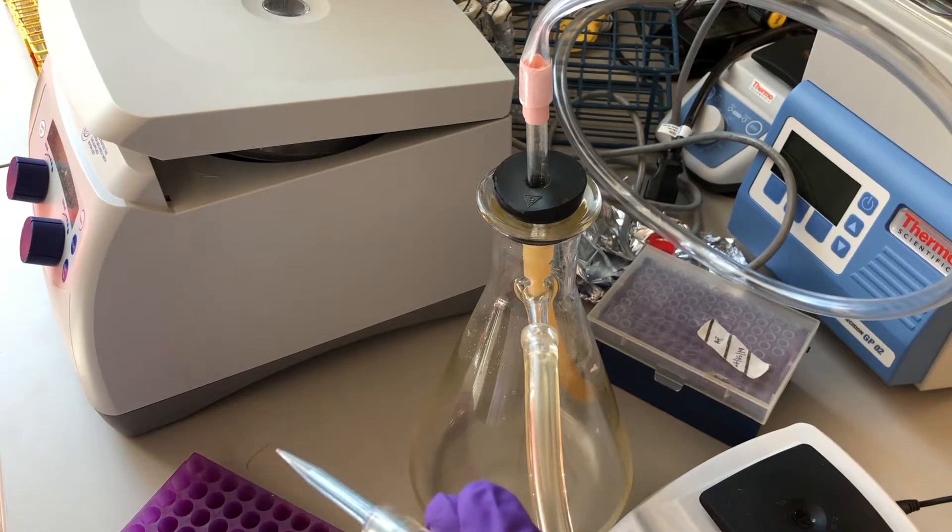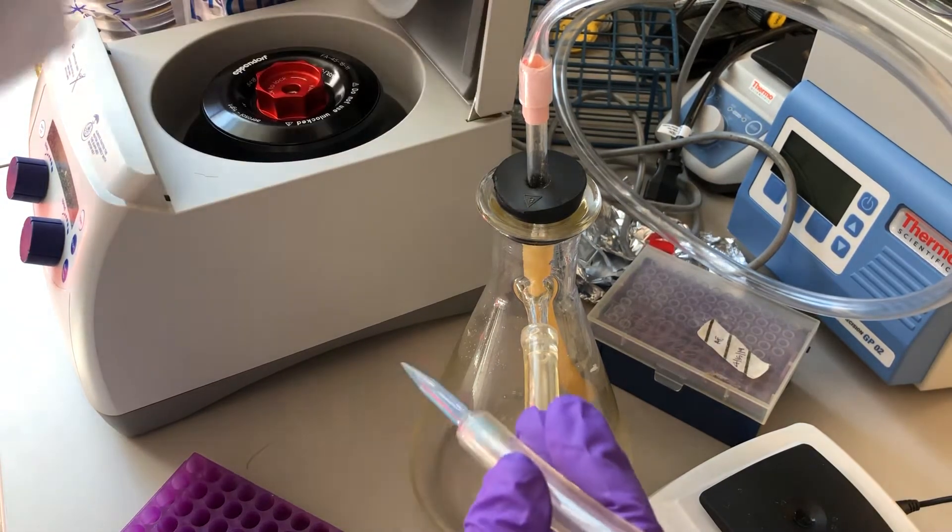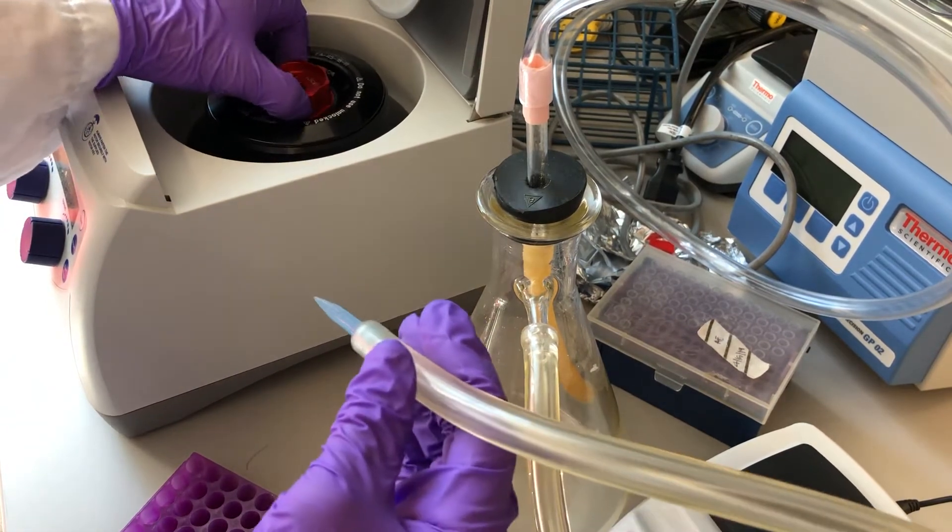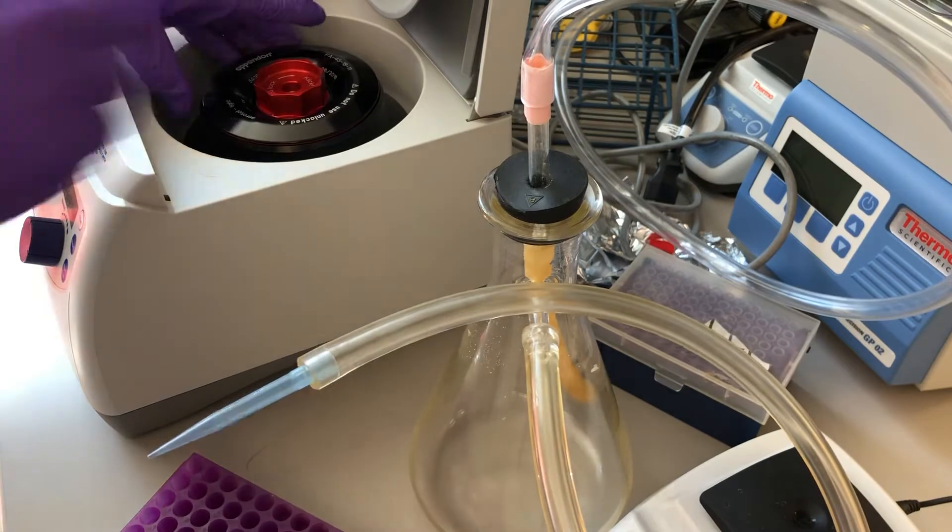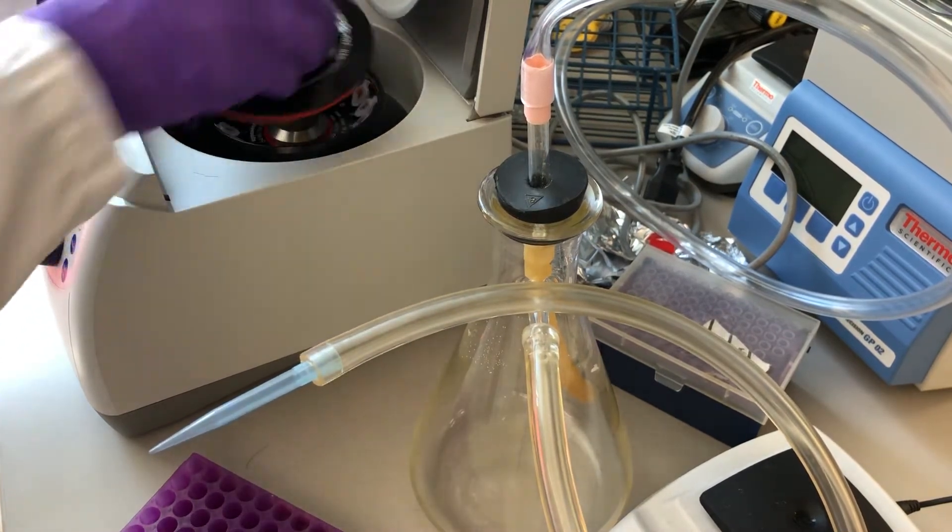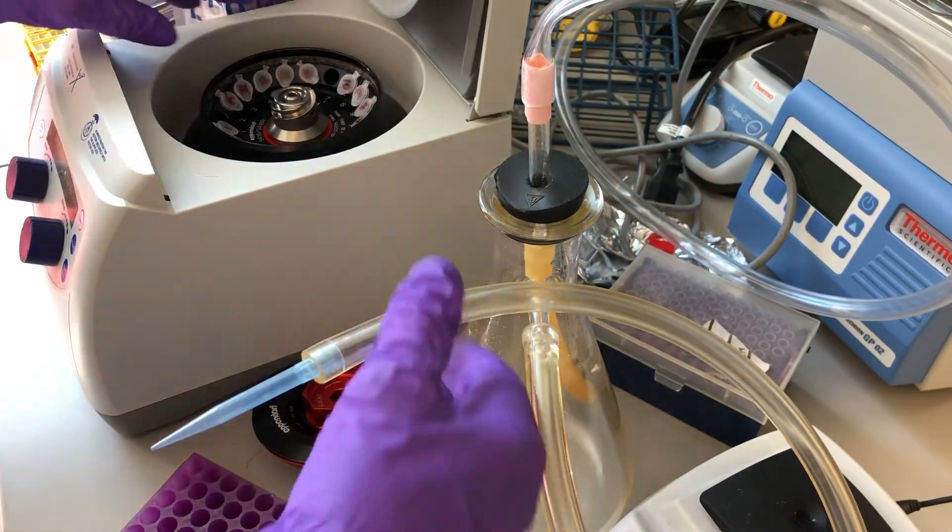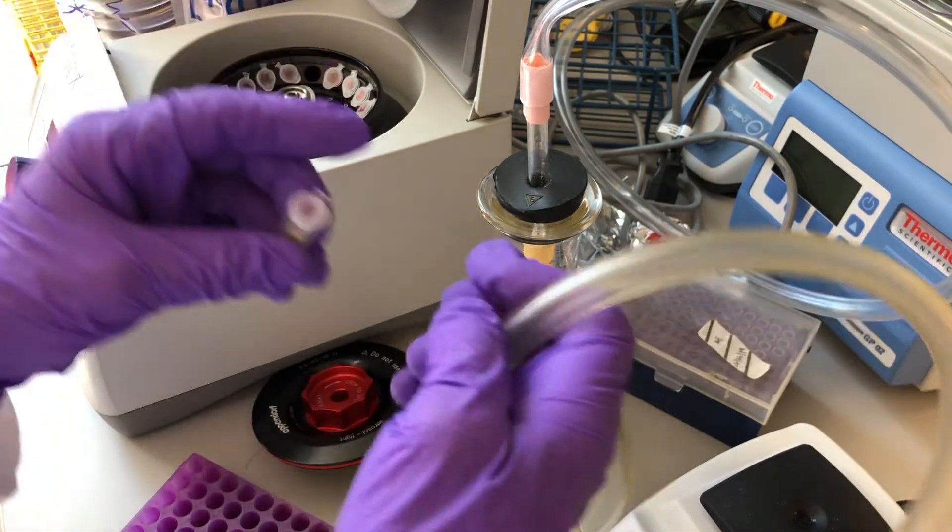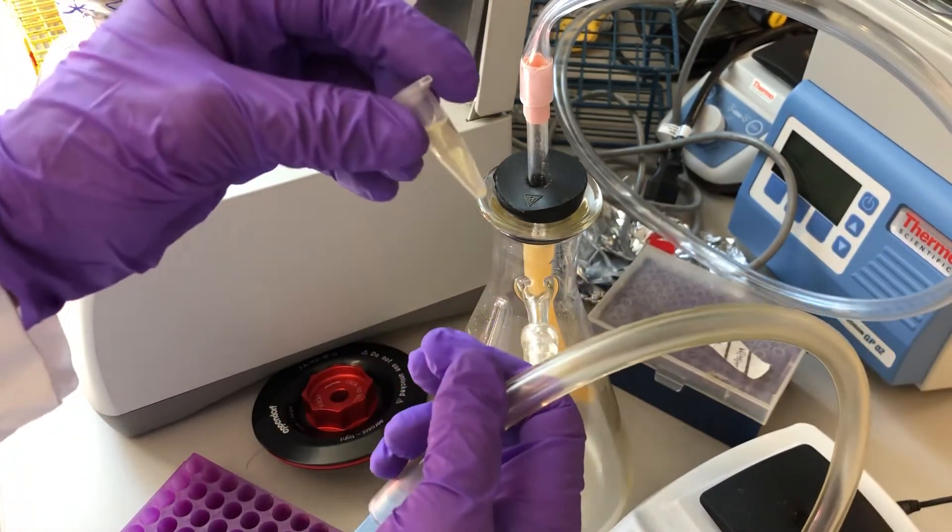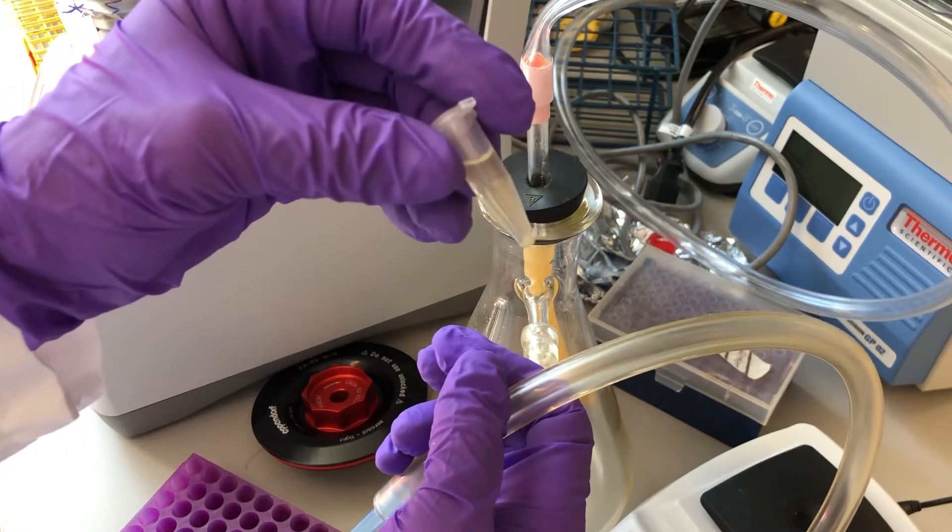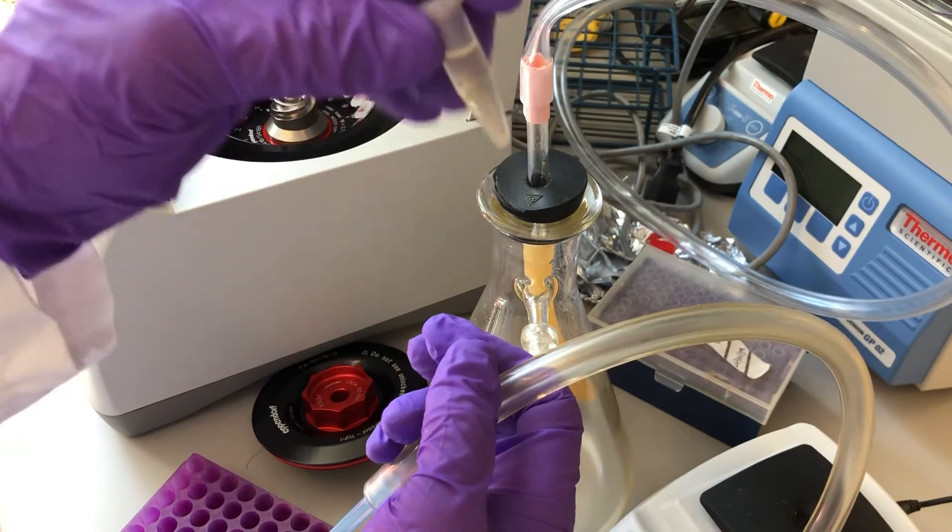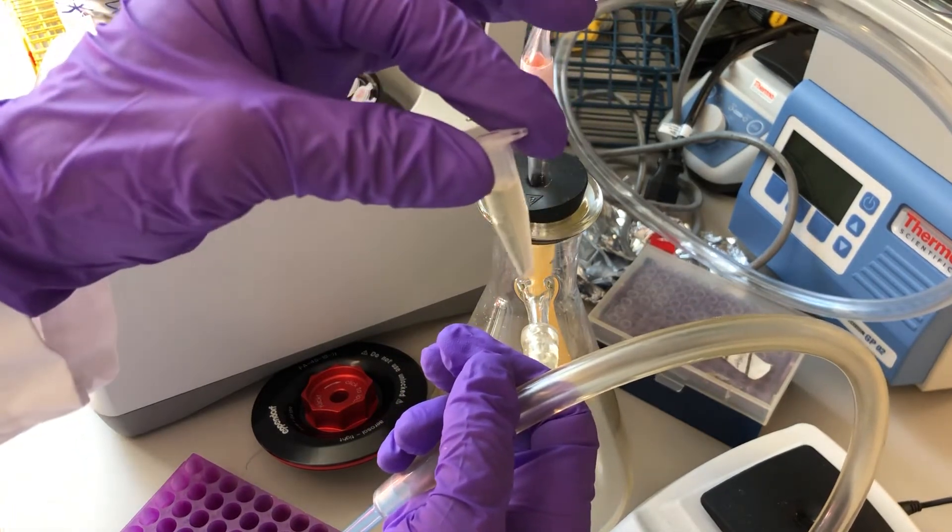So I'll be doing that for each of the harvested cells. Notice there's a pellet at the bottom of the tubes. That's where the cells are and the media is now clear of cells. It's more translucent than it was before.